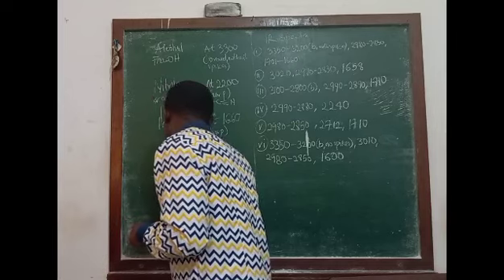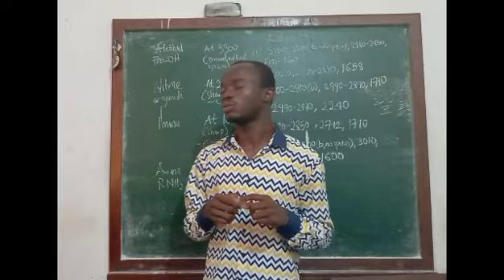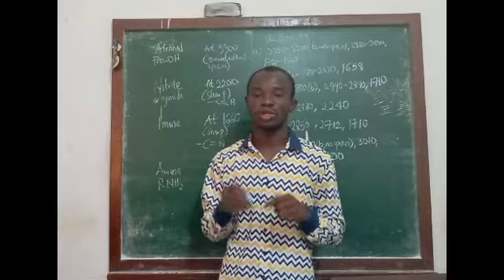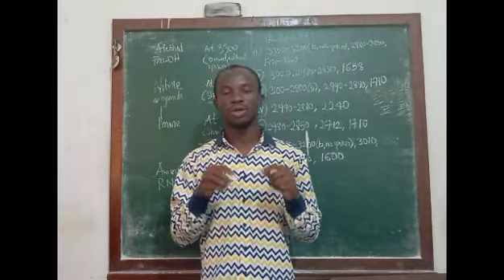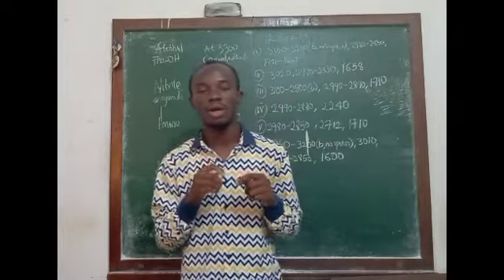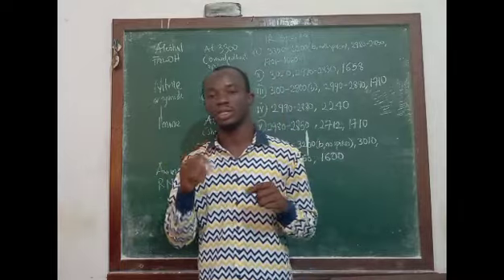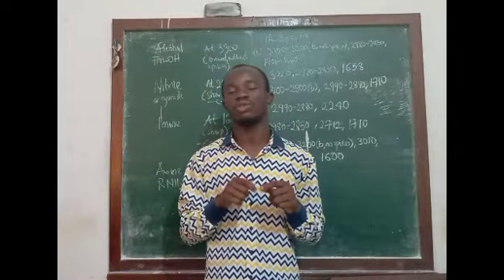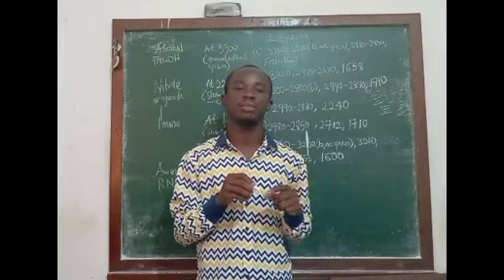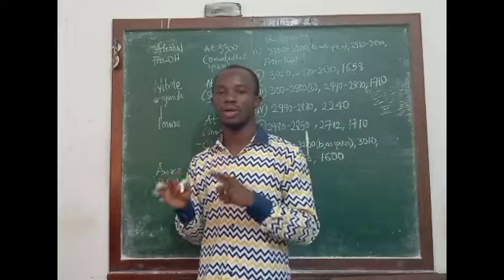Amines, which is RNH2. Now, amines will usually contain your broad signal for NH2 stretching vibration. So a broad signal with spikes around 3,300 will certainly represent the NH2 that can be found in amine or at the same time can be found in amide. But the major difference between your amine and the amide is that one has a carbonyl signal, one does not have a carbonyl signal.